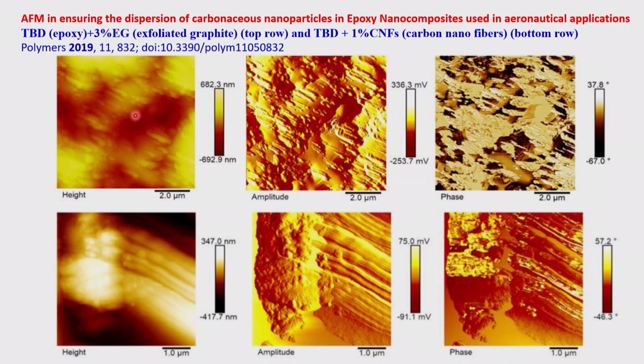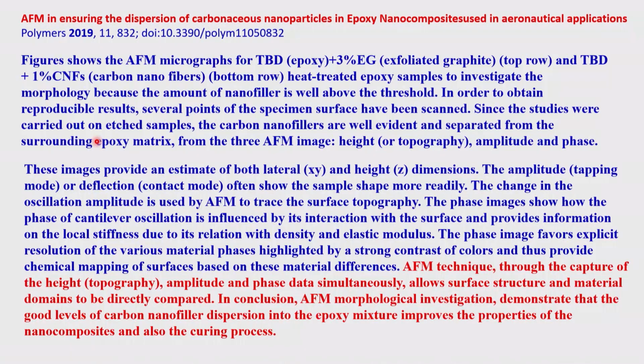Okay, the shape, the topography, and the physical or mechanical parameter of the stiffness of zones. So now you can see where the stiff zones and the less stiff zones are, and how their topological features you can map from this to this, and their shape, etc. So this is the kind of information that one will get.